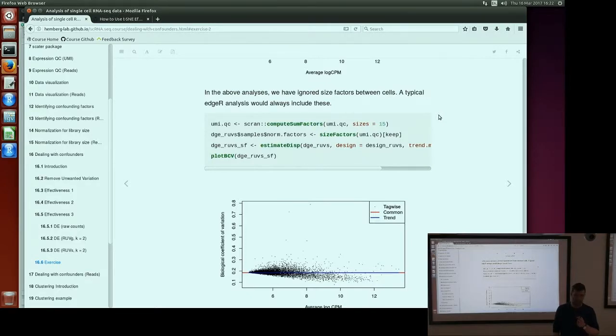I think so, yeah. I don't know exactly how the syntax would work, but absolutely, because you might need to define the size factor slightly differently, but in principle it operates in the same way, and the size factors are used in the negative binomial model in the same way, in the sense of scaling the library size, which comes into the GLM as an offset. So that will work the same way.